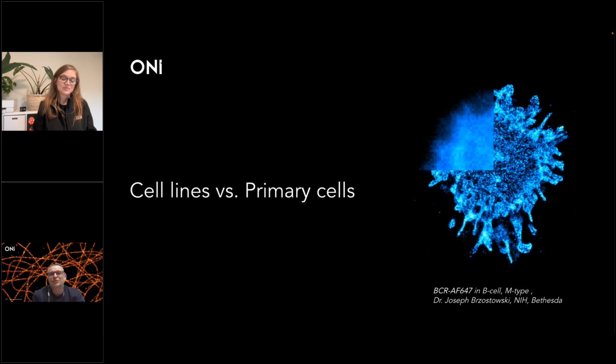So the best thing is to make sure that when a high laser power is on, your molecule is only switching on and off, but not actually bleaching, at least not until you are able to resolve your image. That's why there's a list of fluorophores used for single molecule localization microscopy with specific buffers. There are multiple different buffers, I would say tens of different buffers, and for each buffer, there's a different fluorophore that works well.